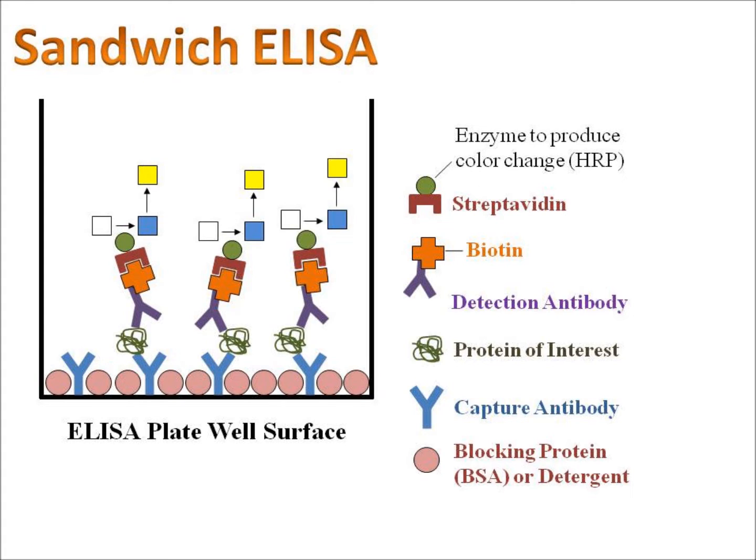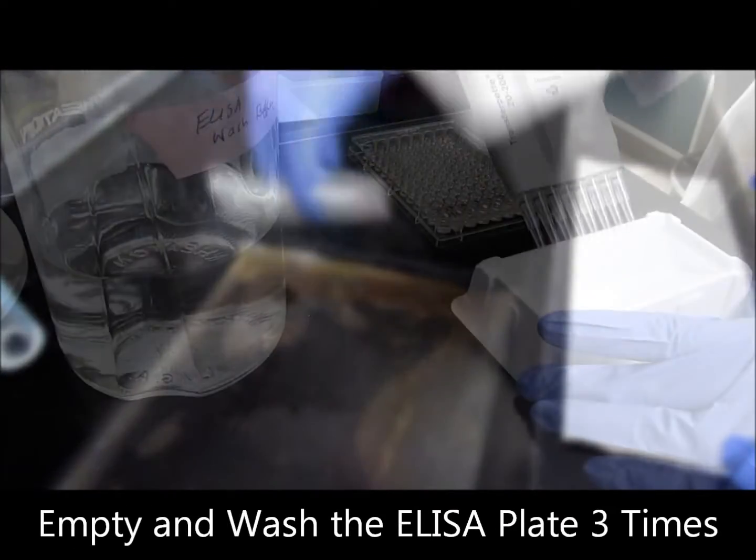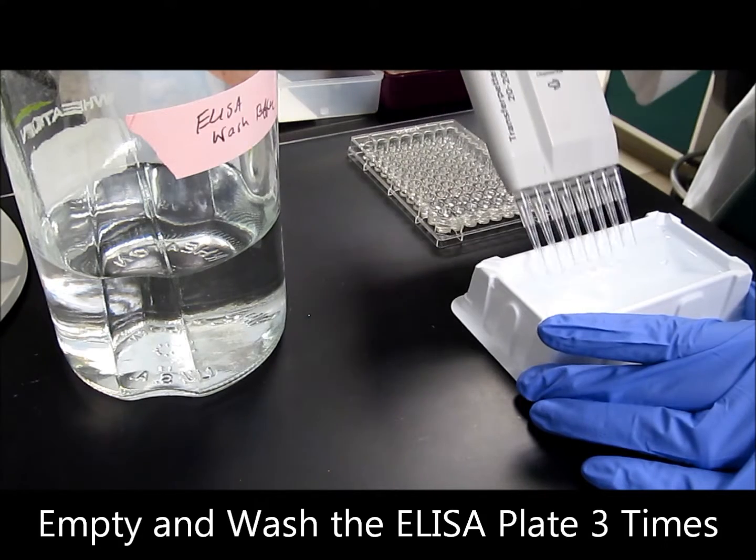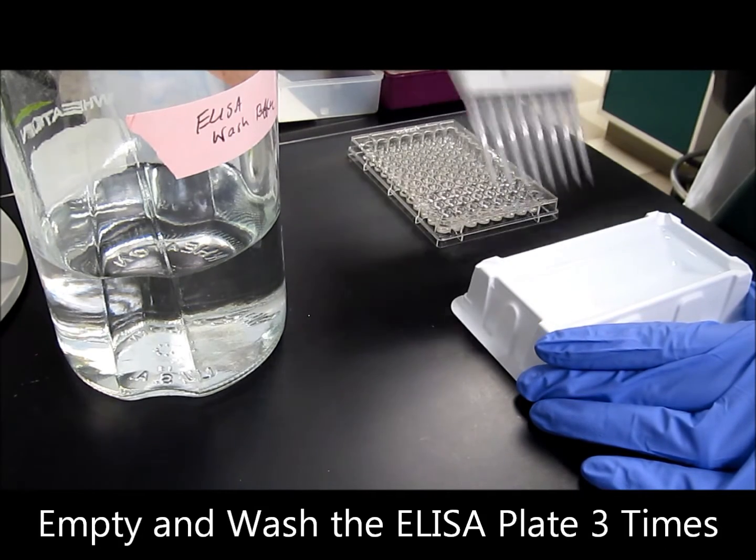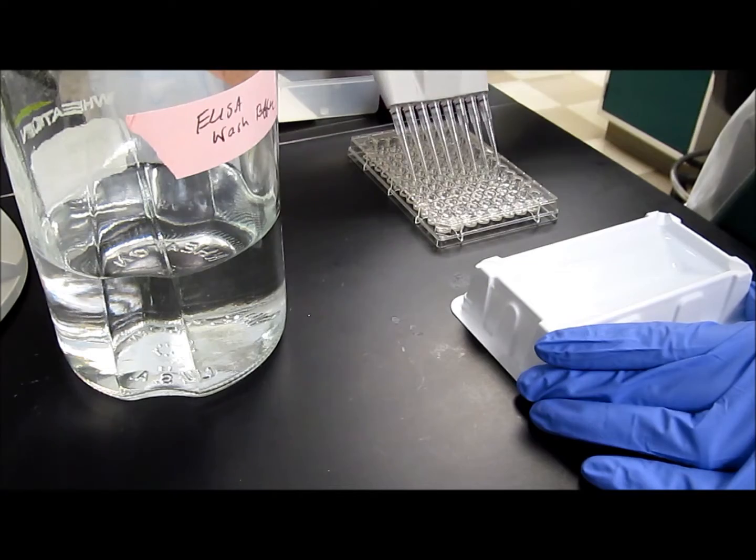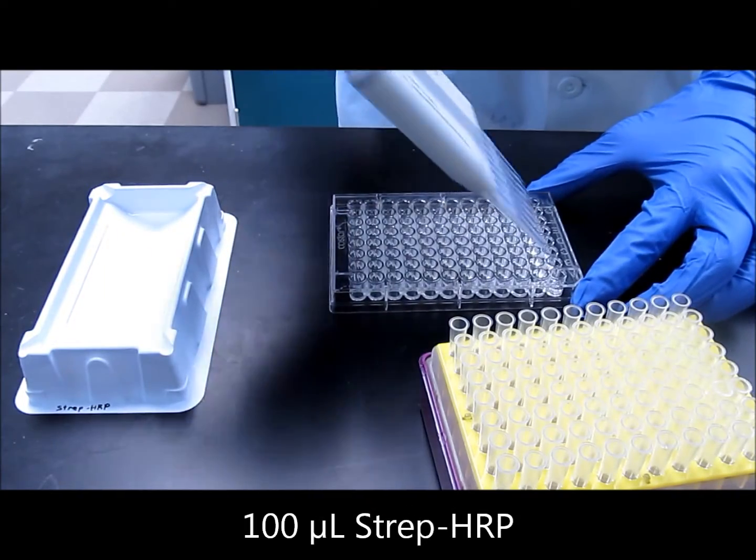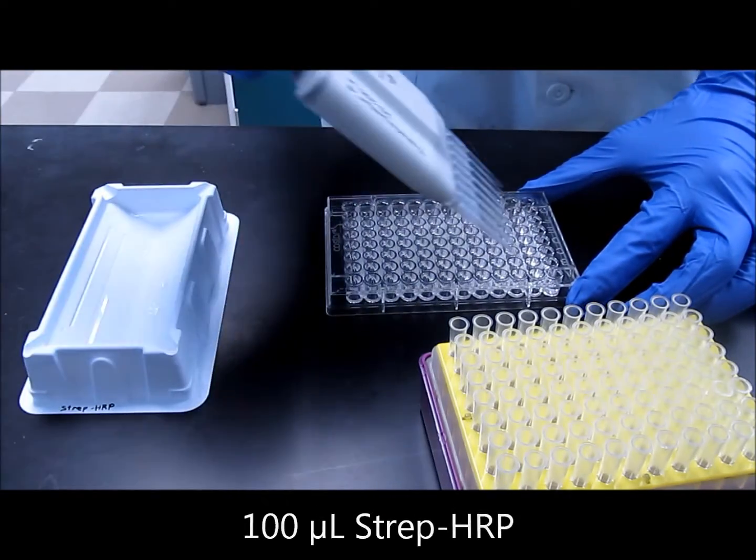Therefore, we have to perform one extra step to get the HRP enzyme connected to our detection antibody in order for us to measure our protein of interest. Once the strep HRP has been diluted, wash the ELISA plate three times in order to remove any unbound detection antibody from the wells. After washing, add 100 microliters of the strep HRP to each well of the ELISA plate.